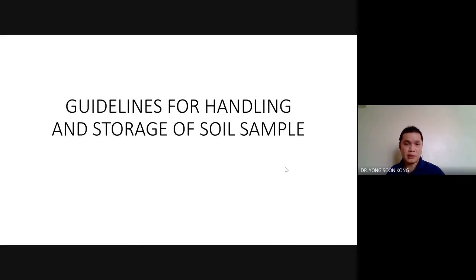Okay, guidelines for handling and storage of soil sample. Now, it is very similar, I would say. No matter if it's a soil sample or water sample, it depends on what contaminants or compounds you want to analyze. From that, we understand some compounds might be volatile, some might not have very long stability in air or in certain conditions. From there, you have to really plan how you want to handle and store this soil sample.